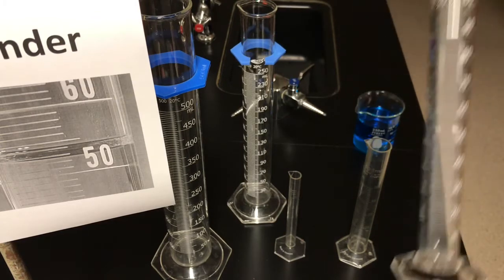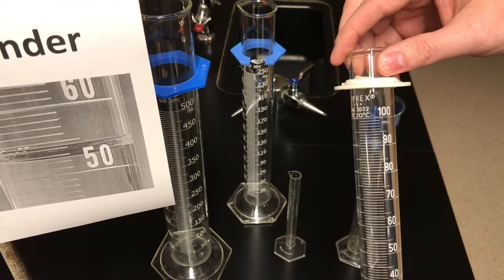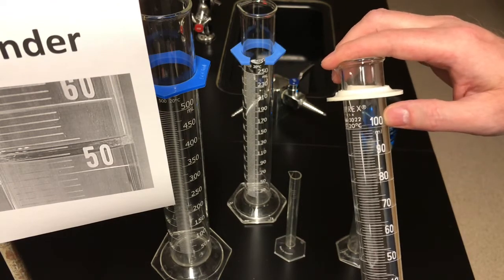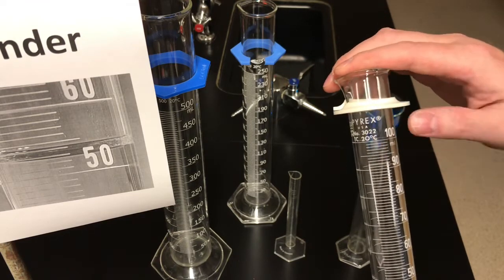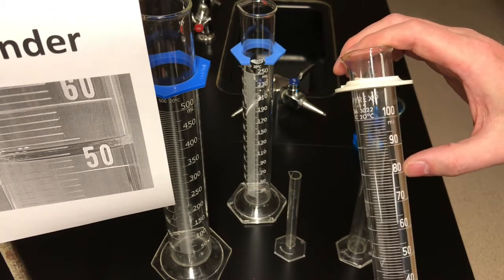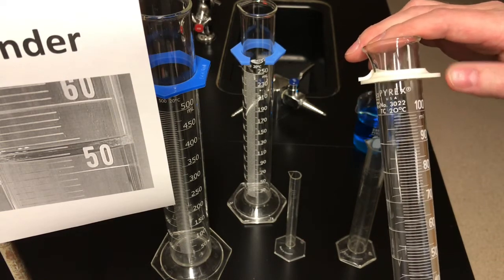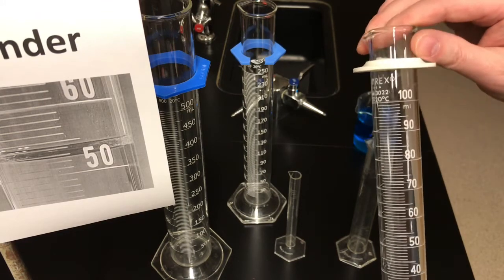Here's a 100 mL graduated cylinder. The major scale is 10 milliliters — going up 80, 90, 100. Again, there are 10 spaces here — though there's not always 10 spaces, so always check that. So you take the major scale of 10 and divide by 10 spaces, and the minor scale is 1 milliliter. Each little graduation represents 1 milliliter.